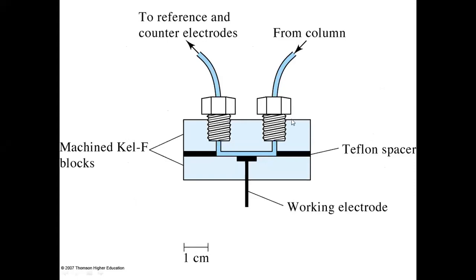The effluent from the column is made to pass through the flow cell, and the variation in the electrical conductivity or the current is measured by means of a suitable galvanometer or ammeter. A galvanostat or potentiostat can be used to regulate the current. The amount of current generated is directly proportional to the concentration of the solute.